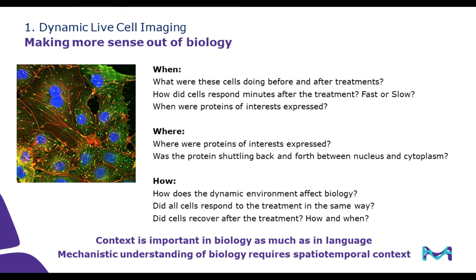And then it also helps us ask questions regarding the spatial information, like the where question. Where were proteins of interest expressed? Was the protein shuttling back and forth between nucleus and cytoplasm? Also, questions like how. How does the dynamic environment affect biology? Did all cells respond to the treatment in the same way? Did cells recover after the treatment? How and when did they recover? This is all important information to help us view the big picture, and simple live cell imaging can help us with that.